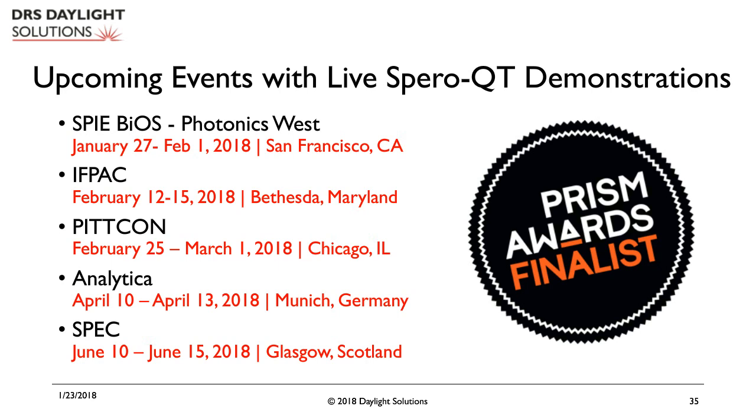Looks like we just had one more question come in. I'll give this back to you, Bill, as well. Question is, have you measured S and N ratios of the spectra? Yes, we have. We have 1,000 to 1 is typical SNR, and in some cases slightly better than that.